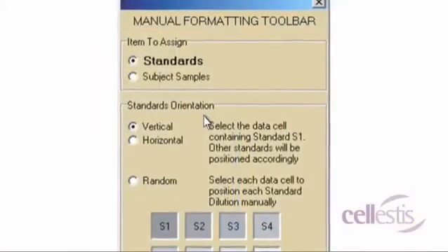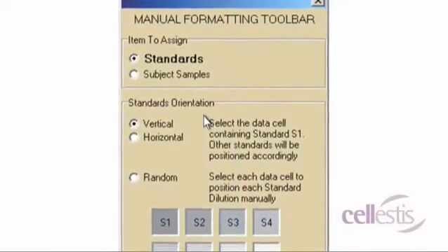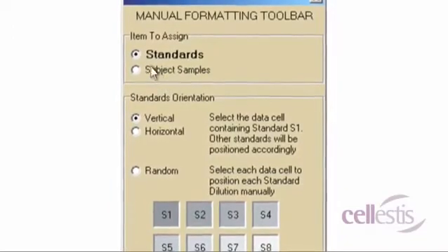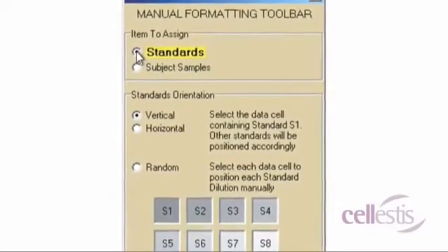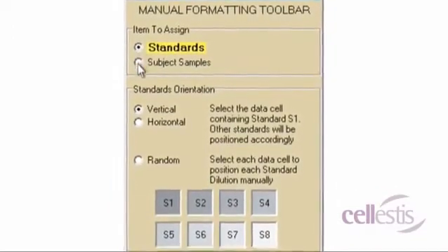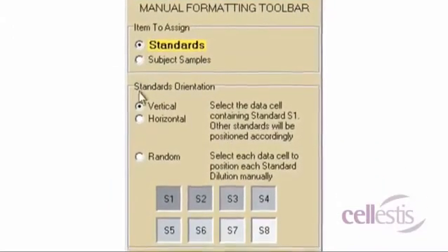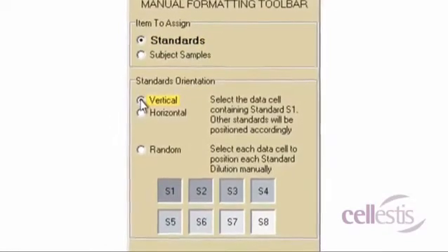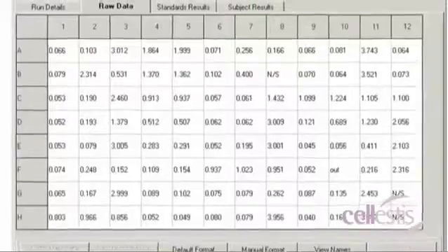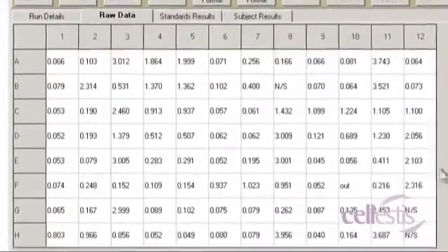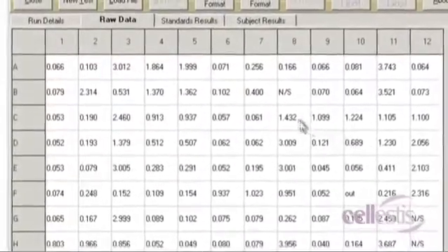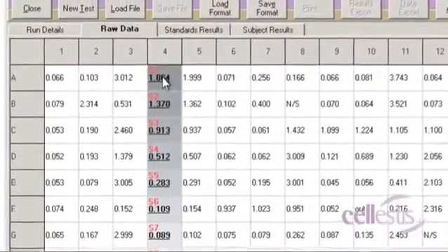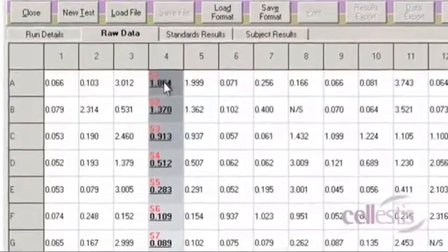To assign standards S1, S2, S3 etc., select the Standards radio button, followed by the radio button for your standards orientation. Click on the cell that contains data for S1. The other standards will be appropriately positioned in order.